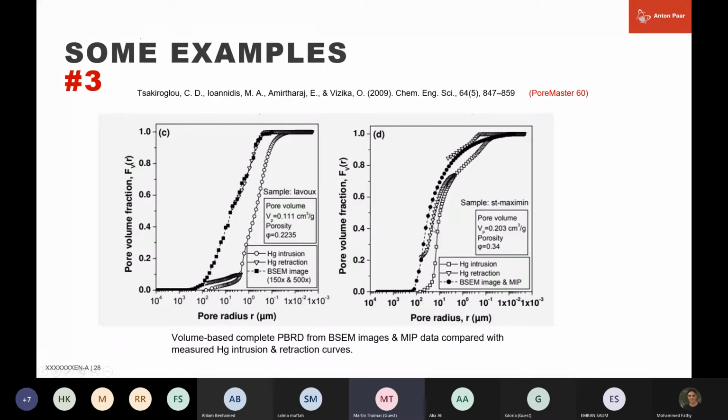In the system, you can do one automatic rerun, but if you leave the sample in there and just run it again, you can do another two, or do it again. You can get as many back to back runs going to different pressures, first one, second one, third one, and so on.